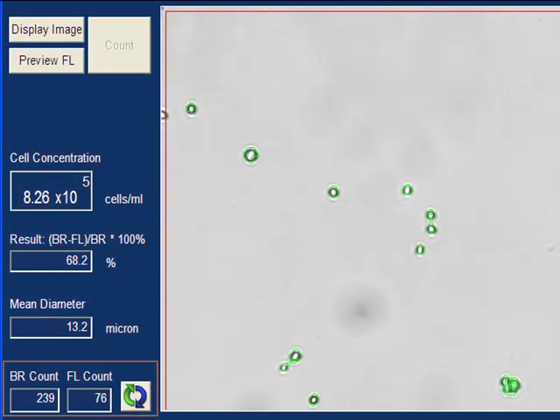...the initial results table displays total cells counted, concentration, percent viability, and mean cell diameter.